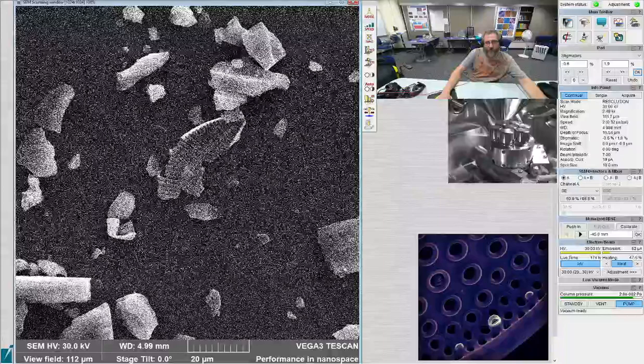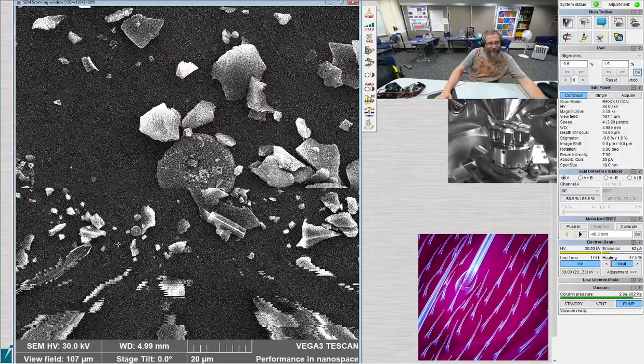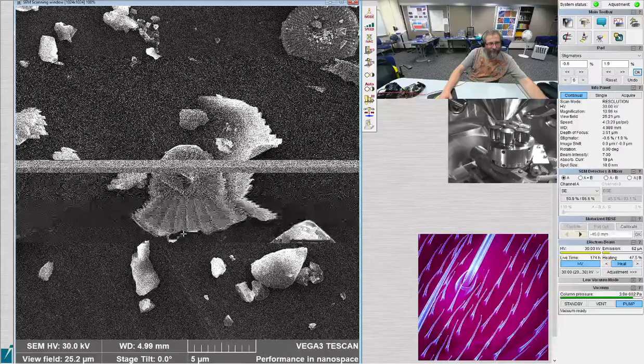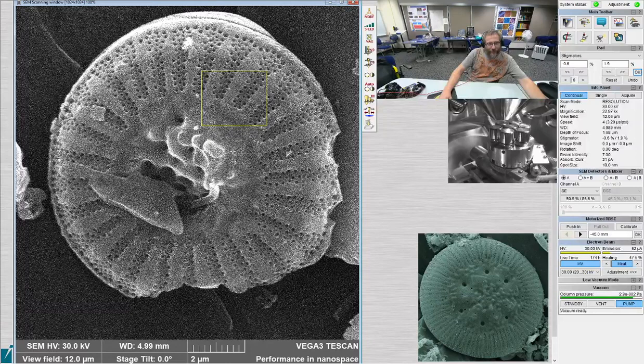Can they choose to leave? I think that's in reference to the bacteria. No, I don't think so. I don't think they have a whole lot of say in what happens after they get put in there. Ooh. That's one of those mystery ones. Lumpy. Yep. Lumpy undulate.